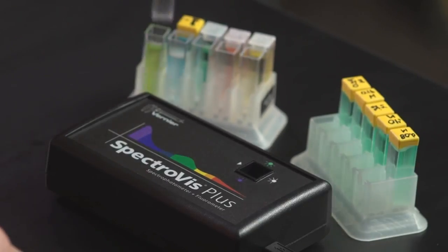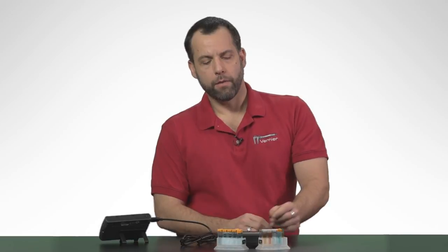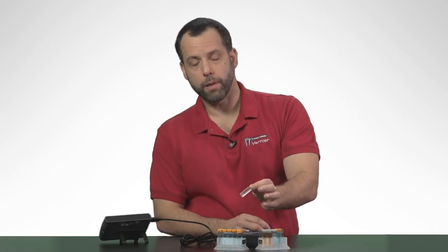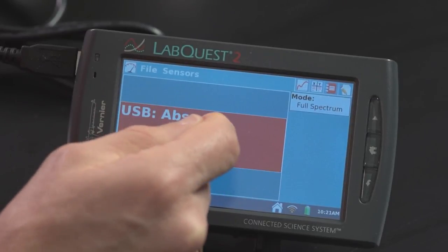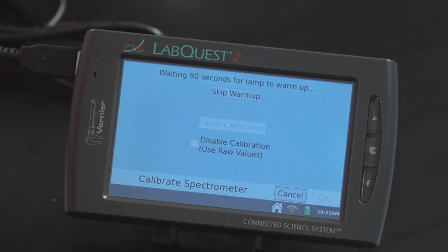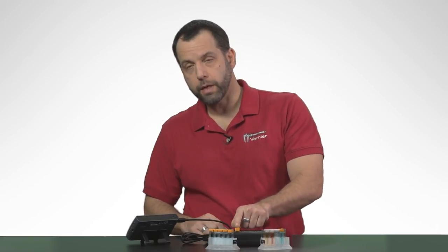Now to calibrate it, I'm actually just going to use a sample of water. You need to remember that when looking at absorbance, absorbance is a unitless measure. We're actually looking at the amount of light that travels through some type of solution relative to our blank — and in this case, my blank is water. So we'll calibrate the device; I can just tap on the meter screen and select calibrate. Most spectrometers take 10 to 15 minutes to warm up, but this spectrometer only needs 90 seconds from when it's plugged in. So I've been talking for over 90 seconds and I can actually skip this warm-up, leaving my blank in here.